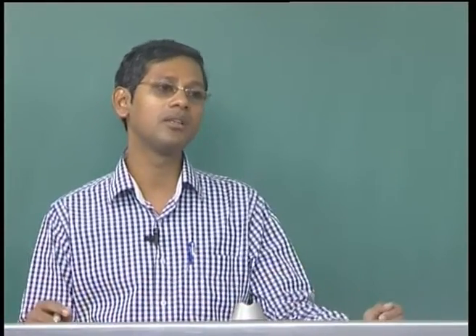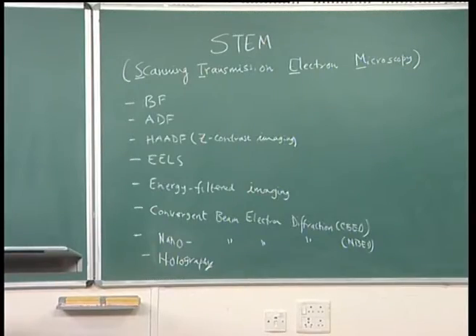Therefore, you need to first learn how to obtain good images in the electron microscope, such as a Titan, and then compare these images with the best possible software available in this world to extract quantitative information about the micrographs. So, with this I close the high-resolution electron microscopy portion of this course, and I move on to the next portion, that is called STEM, scanning transmission electron microscopy.